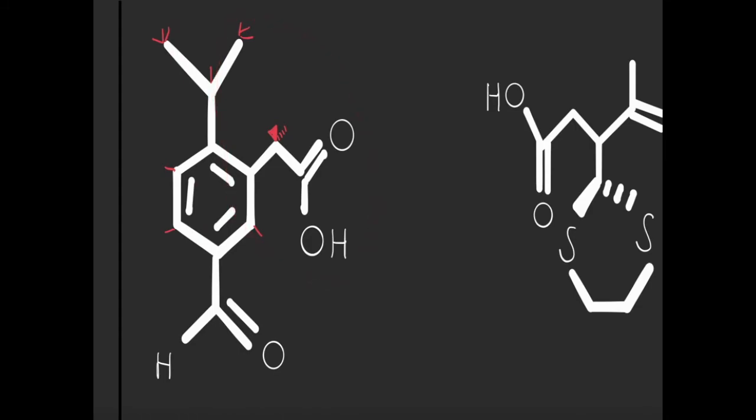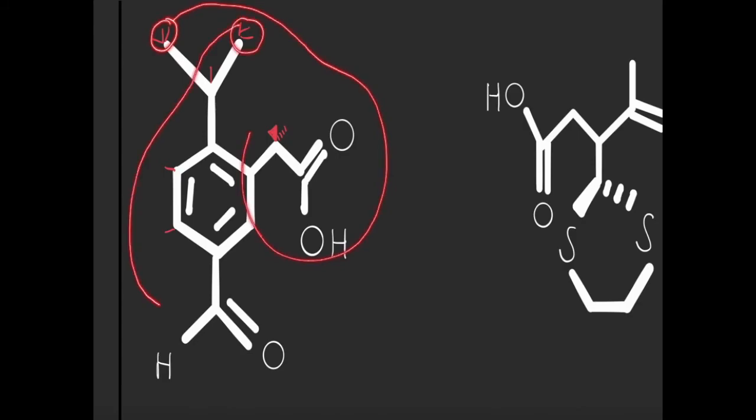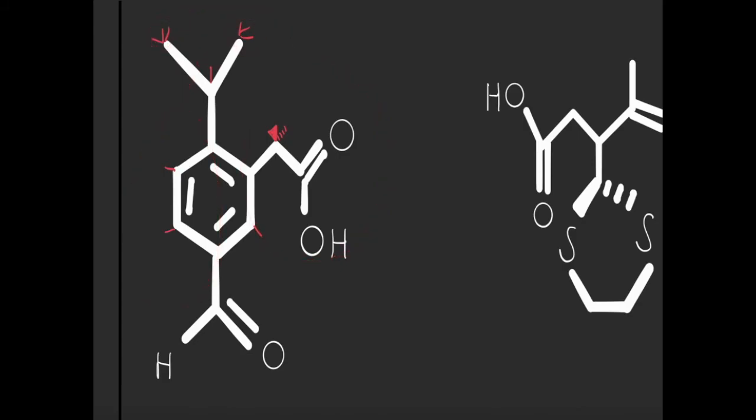And the reason for that is because this carbon, see, this is a rigid double bond, you can't rotate it. So what's stuck on one side will be stuck on one side, and what's stuck on the other will be another. But this carbon right here, this whole thing right here can rotate. It's going to rotate that way or that way. And so this carbon will end up being able to see this, and this carbon will end up being able to see this side, even though you normally think it wouldn't, but it can because of that free rotation.